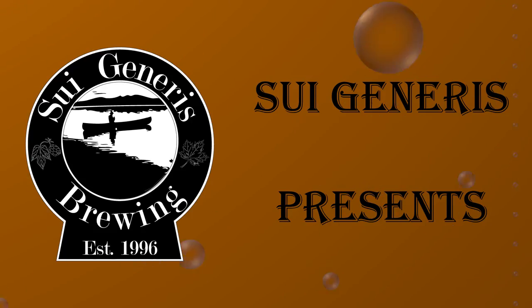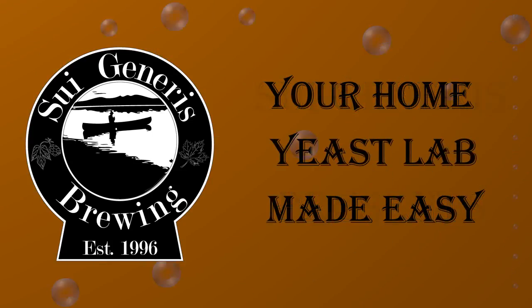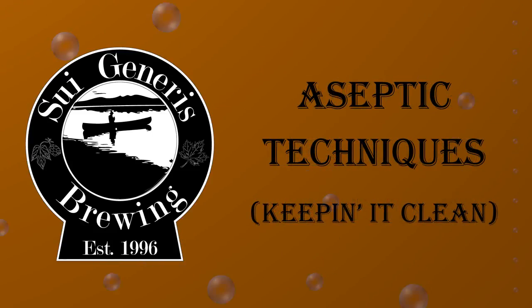Welcome to my third video on your home yeast lab made easy. In this video we're going to talk about aseptic techniques — these are the methods that you use to ensure that your samples remain clean when you're working with them in your home lab.